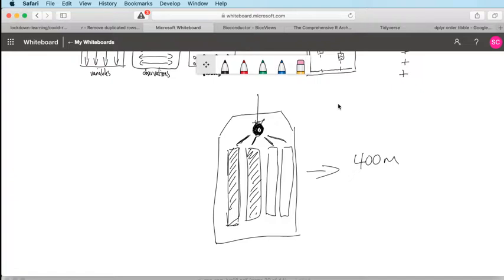The way that works is to do with the molarity of all of your libraries in the mixture that you load onto your flow cell, which means that if you've got 20 libraries in your mixture that you're loading onto the flow cell, it doesn't mean that each one of those libraries will just magically get 20 million reads.